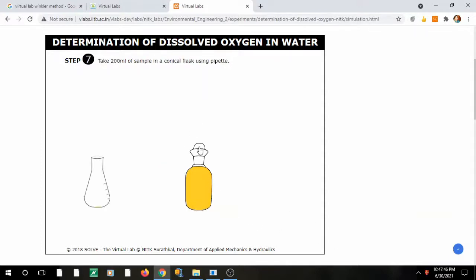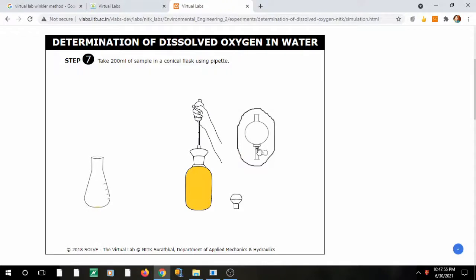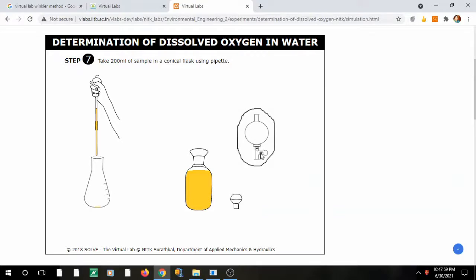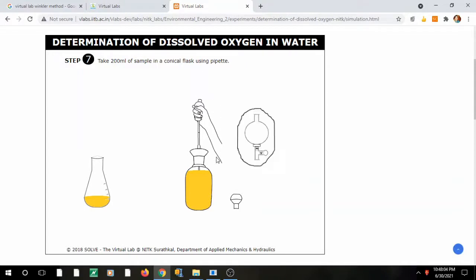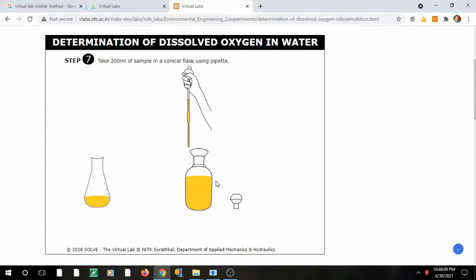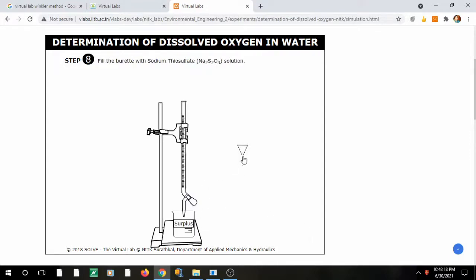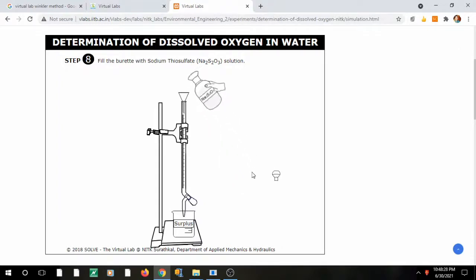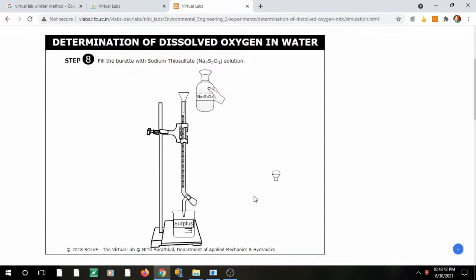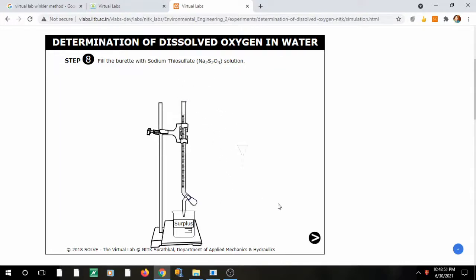Mix the sample to combine the H₂SO₄ properly. Remember H₂SO₄ has two roles: first, to dissolve the precipitate; second, to liberate iodine. Now take 200 ml of this water sample into the conical flask — press the down arrow to release the water sample. Do this twice to get 200 ml total. Your water sample is now ready for titration.